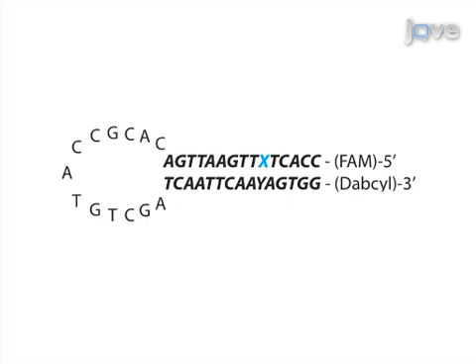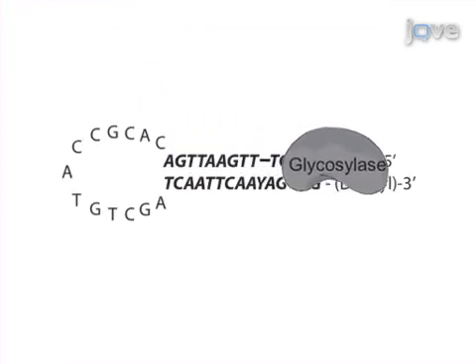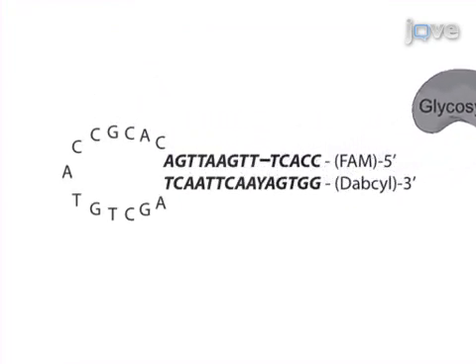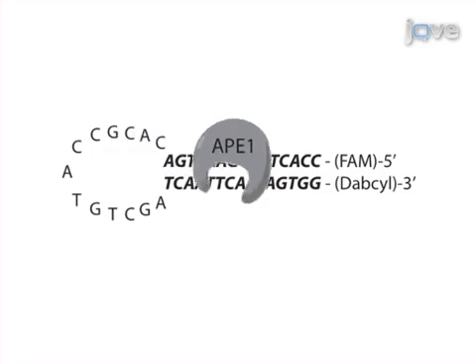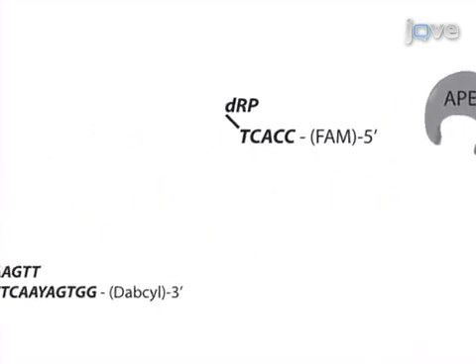To assess DNA repair activity, beacons are incubated with cell nuclear extracts, which contain repair enzymes. DNA glycosylases recognize and remove the DNA lesion in the beacon. The resulting abasic sites are substrates for AP endonuclease 1, or APE1.